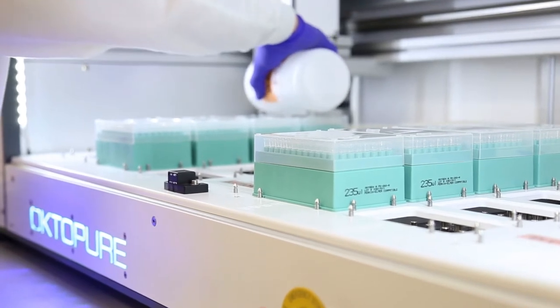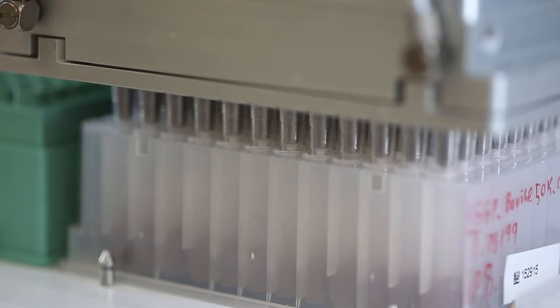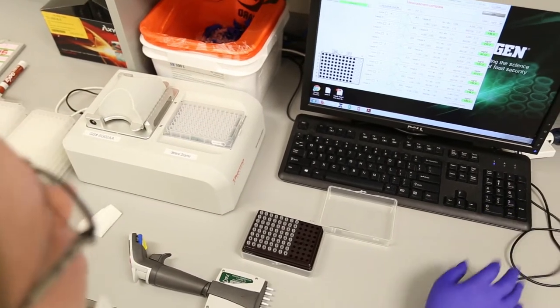Special instruments isolate the DNA by binding it to extremely small magnetic beads. While the bead holds the DNA molecules, the chemistry washes away other parts of the cell or organic debris. The result is isolation of a clean, pure sample of DNA.